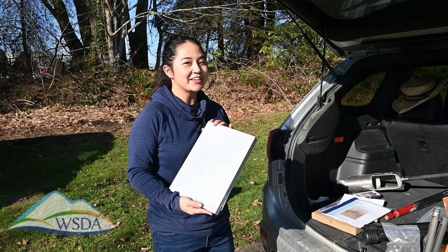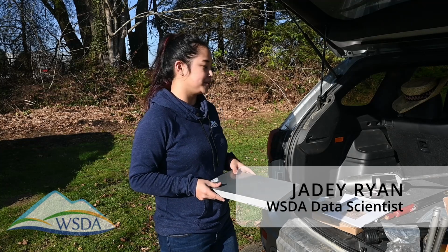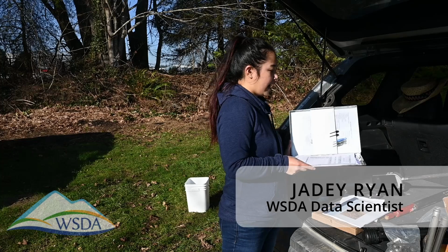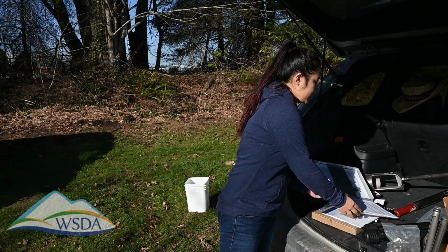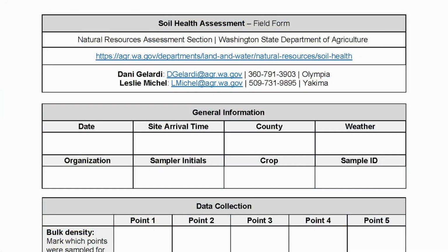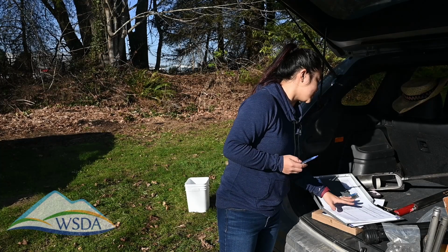Okay, we recommend having a clipboard that has your field forms, your chain of custody, and your labels, which you can pre-fill out before you head out into the field. When you arrive at the site, you'll fill out the top portion of your field form, which is this form, and you'll fill out your date, the site arrival time, your county, weather, organization, your initials, the crop field, and the sample ID, which WSDA will assign beforehand. So that's all the part that you'll fill out before you start sampling.